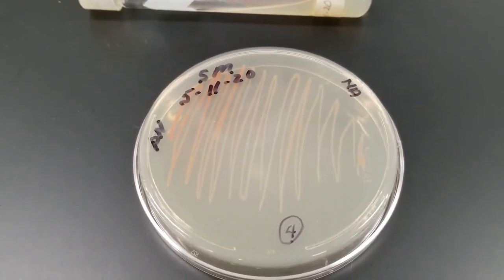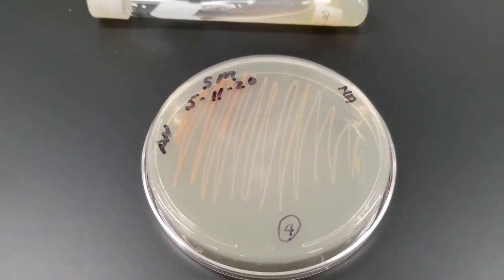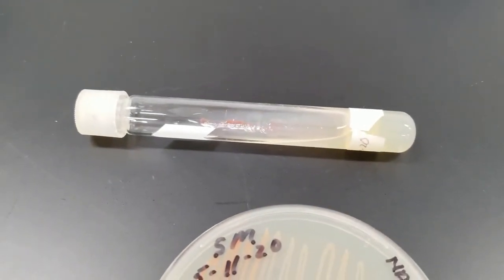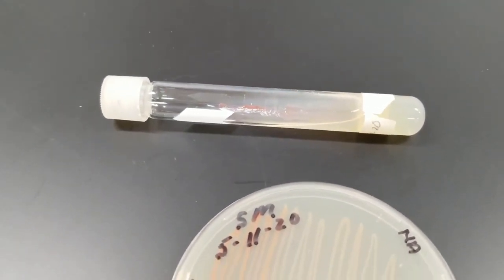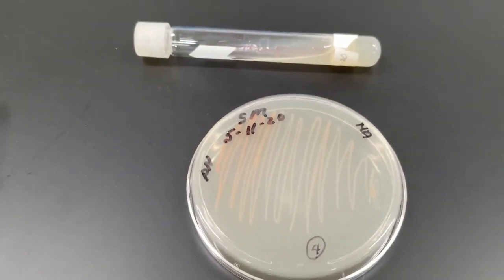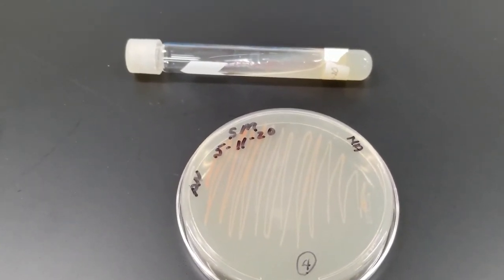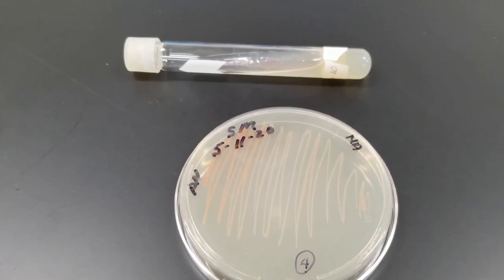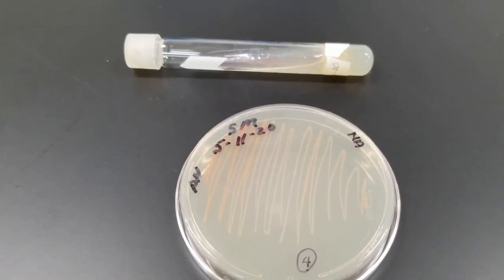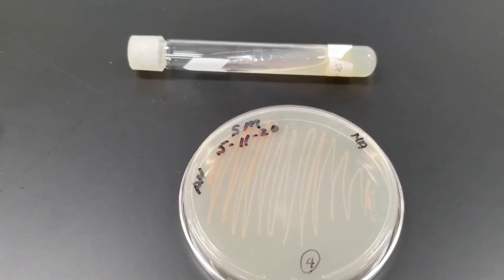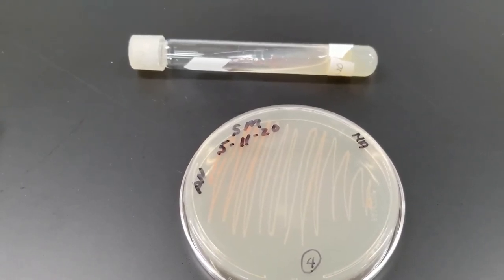As you can see, we have growth here. Bacteria oftentimes will look kind of a beige. Depending on the species, maybe a yellowish. This particular bacteria, Serratia marcescens, at room temperature often has this reddish pink color to it. If you grow it at 37 degrees, you do not see that color. It will just be beige.